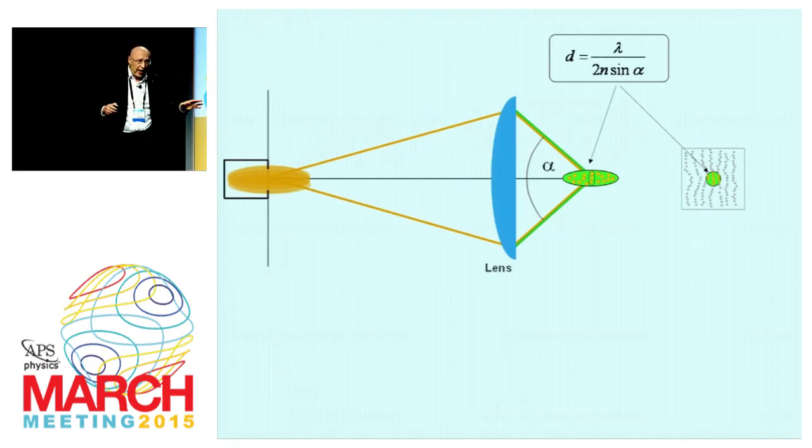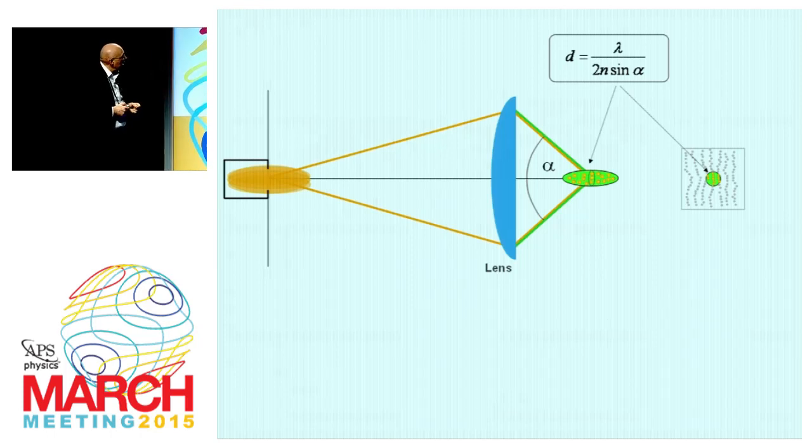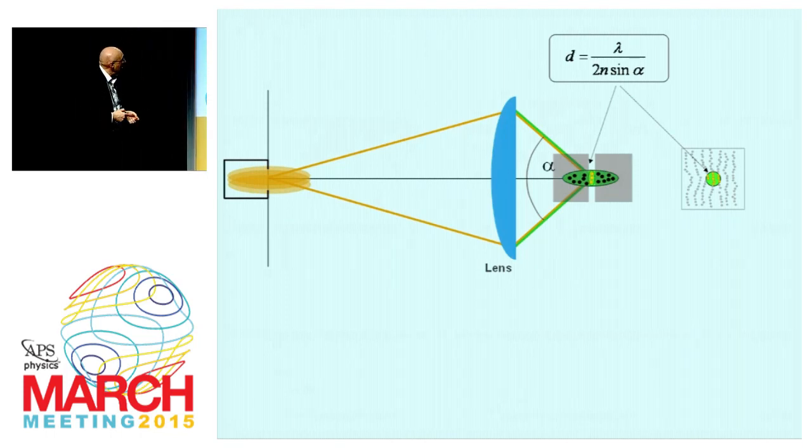We cannot change the fact that we have a diffracted beam in here, but maybe we can change the fact that all the molecules that are flooded here with light, with excitation light, with illumination light, are capable of scattering light back to the detector. In other words, if we manage to put some of the molecules in here into a state in which they are not capable of producing light at the detector, then we can discern those that can produce light here from those that cannot produce light.